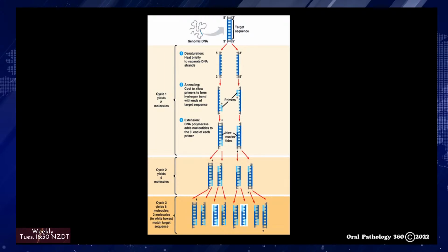The reason for this is that after the first cycle, it is no longer only the original DNA template that is being used for amplification, but also the new strands that were used in the reaction. Additionally, we do not add just one Taq polymerase or primer to the sample. We add several to float around the reaction. So the number of DNA molecules can roughly double with each round of cycling.